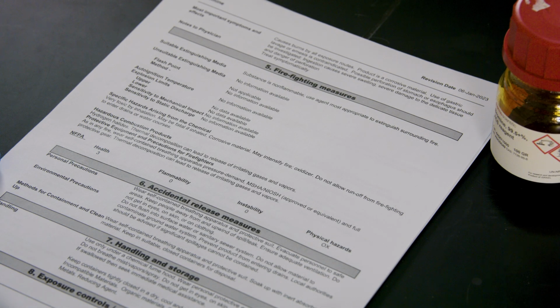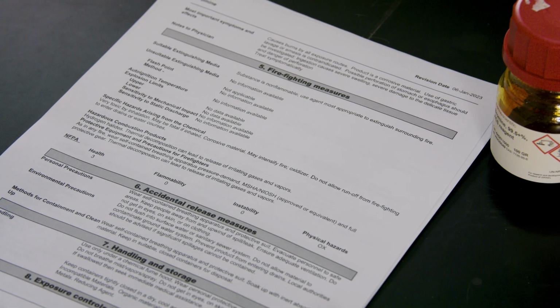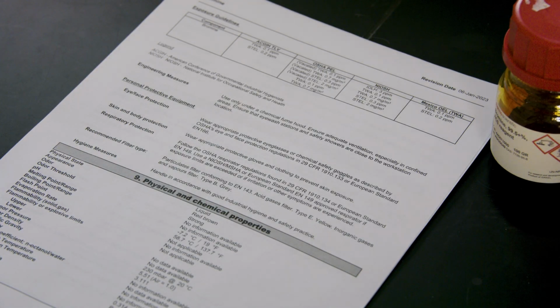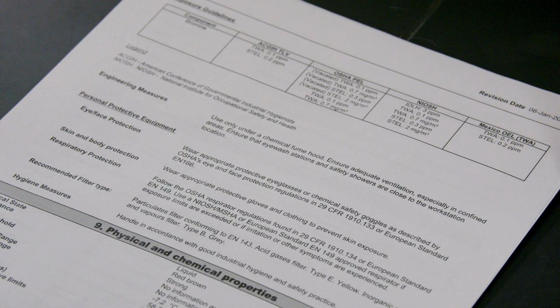In Section 8, you'll find details about exposure controls and personal protection. This section tells you about the recommended exposure limits and the personal protective equipment you should use when working with the chemical.